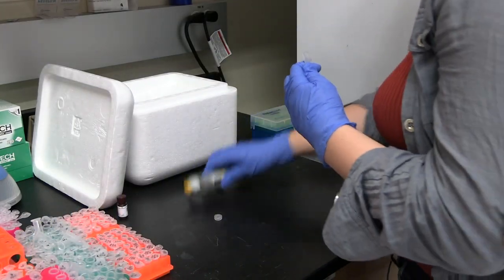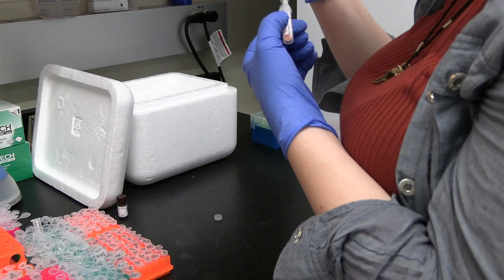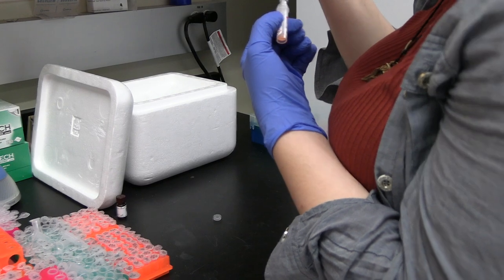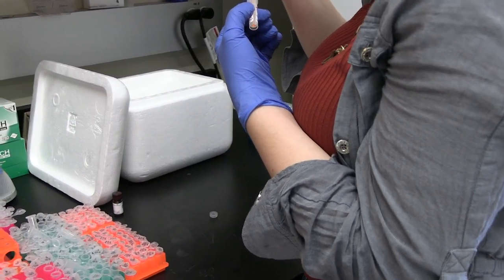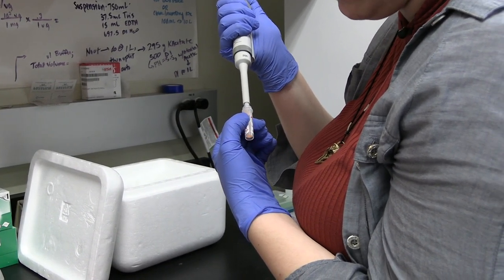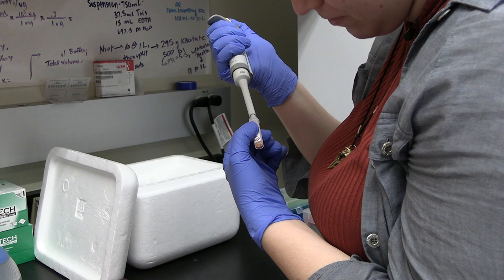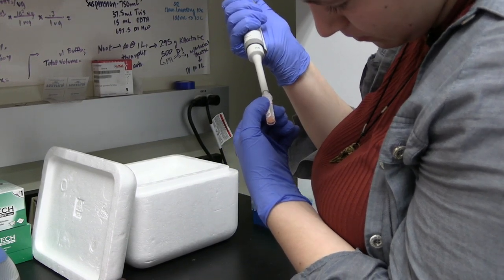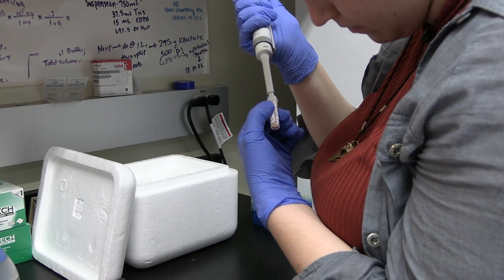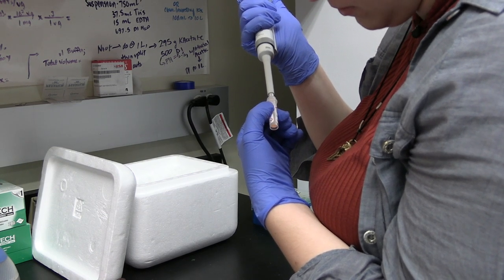Okay. And then what I'm gonna do is just keep pipetting up and down for quite a while until I see that it's fully dissolved. And with lyophilized powders, DMSO, cytoskeleton proteins, this can take like a few minutes, so you may want to even just let it sit for a bit to be sure that it's very well mixed, because the last thing you want is just clumps of dye in your sample. Okay. This seems to dissolve pretty quickly. Try to get minimal bubbles, but really the point is to dissolve this as best as possible.